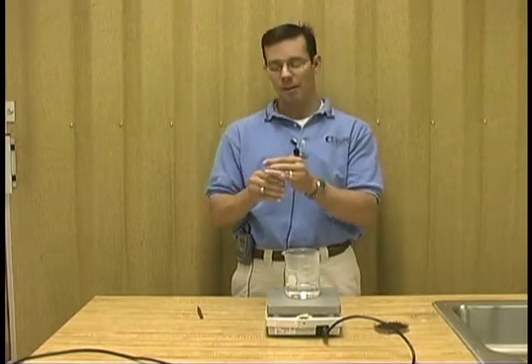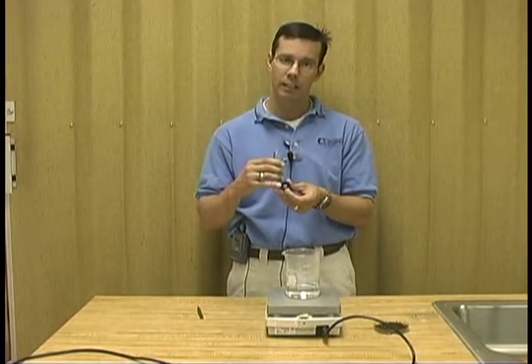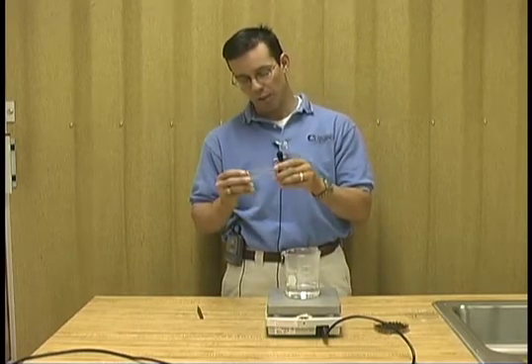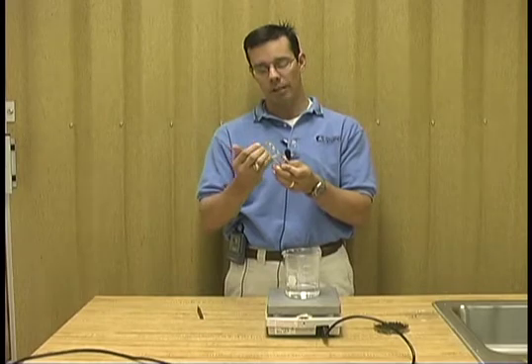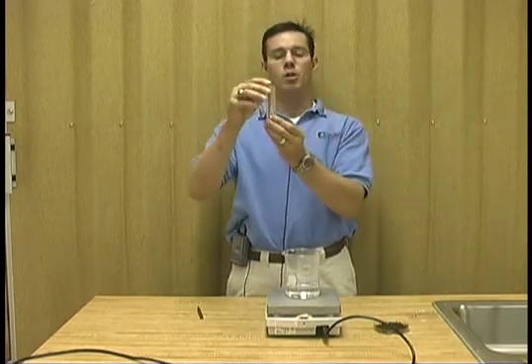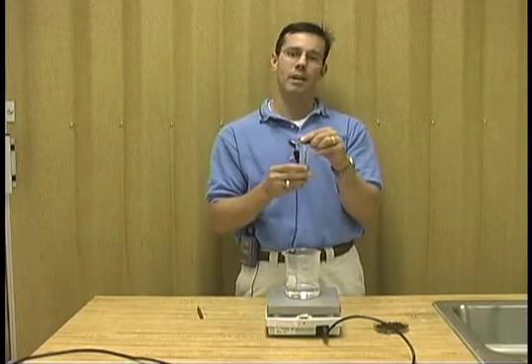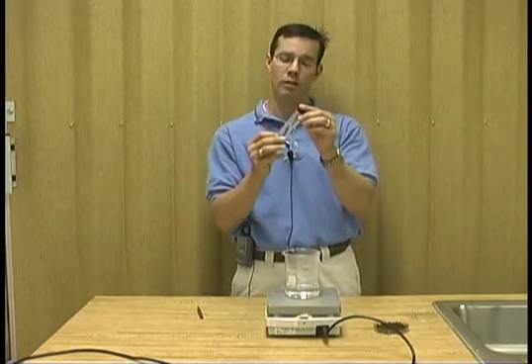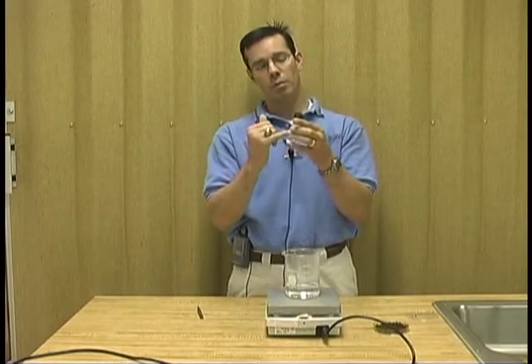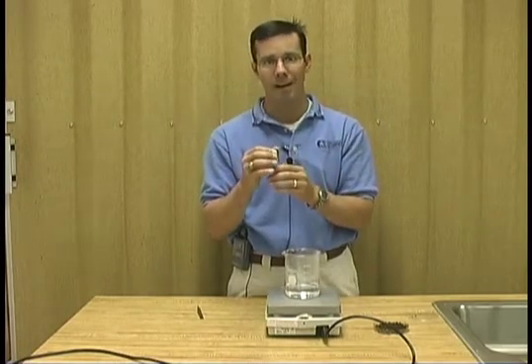This is an example of a vial that we use in our laboratory for preserving insects. It's got a polyethylene seal in it, which prevents it from leaking. One thing to recognize is that when you put alcohol into a vial, there is an air bubble in there. That is not good because when you place your insects in there, that air bubble — every time this vial is moved — will damage the insects. So what's important is that when you put alcohol into the vial, you fill it to the top.